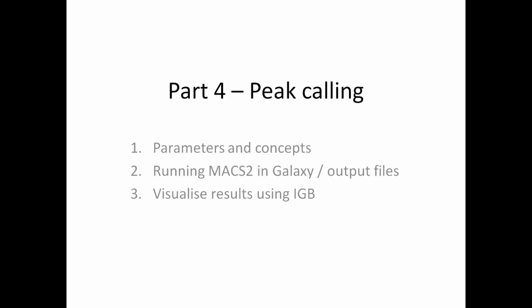Now, our group has released a MACS2 tool on the Galaxy toolshed, and it's been tweaked to suit our requirements, but it's available for anyone to use. And if you're looking for this on the Galaxy toolshed, the author is P.J. Briggs.